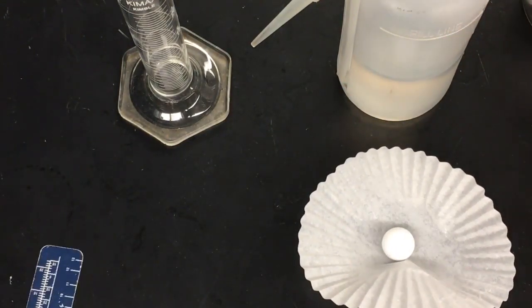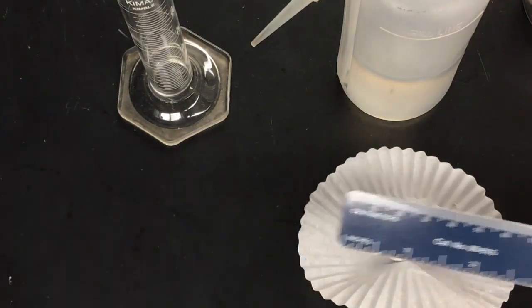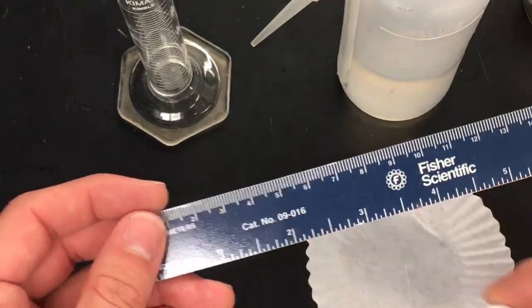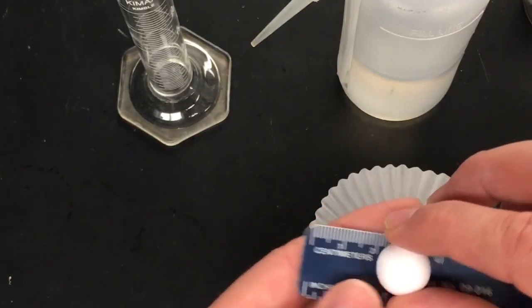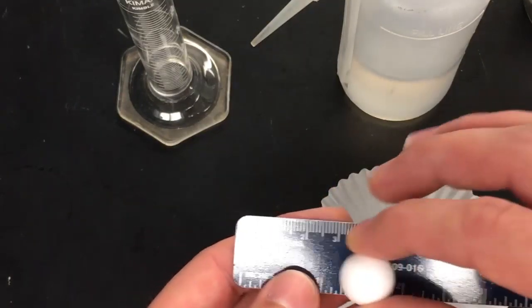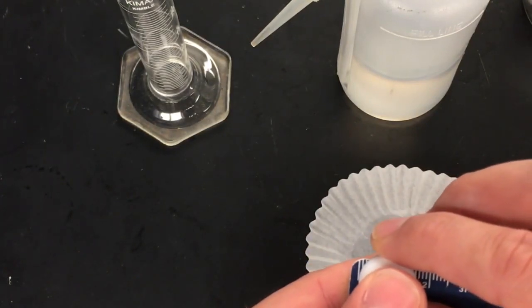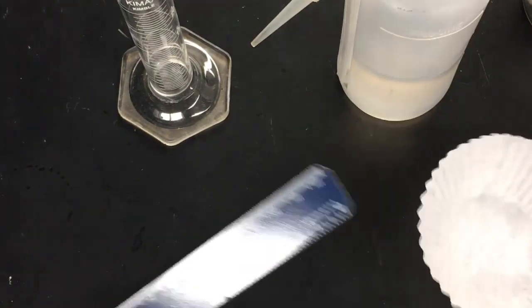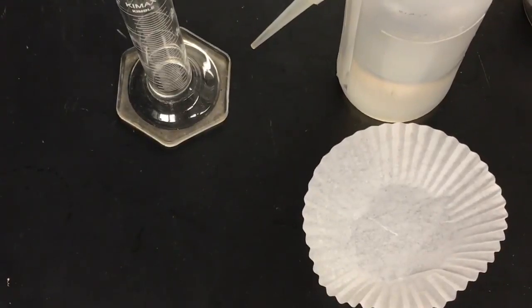So maybe the first thing would be obtaining a diameter of the Teflon ball. One thing I like to do when I'm taking a measurement of something that's round is I just like to hold it up against the ruler, and even though it's round, I try to see how I can put one edge right on that 0. I try to steady the camera.